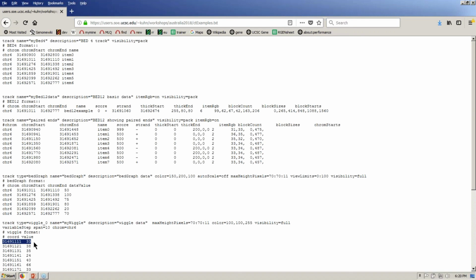And if some exons are poorly covered, if you're doing an exon capture experiment, you can graphically view your gene of interest, and you can say, oh, wow, check that one out. That one exon is really not very well covered. Therefore, I have to be suspicious of any variants I see in that region because I don't have very good coverage. Or it may give you information about isoforms. It may tell you that not all the cells in my sample are expressing the isoform for which that exon has a low signal. So there are a number of different scenarios.